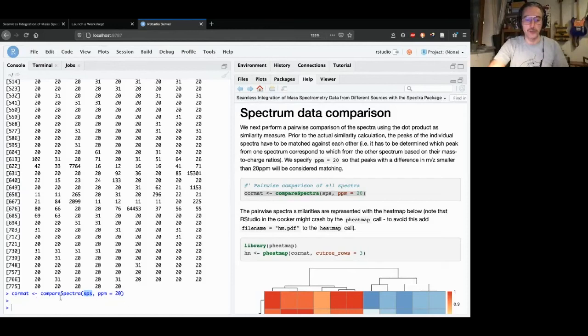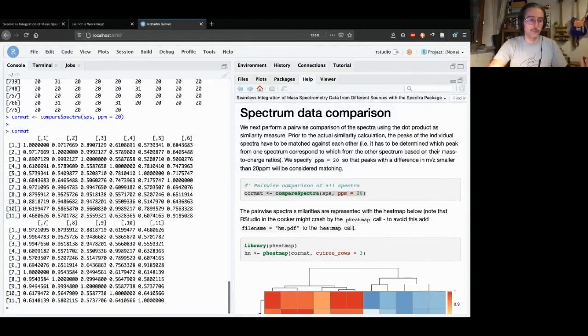So it's creating now a similarity matrix, 11 columns, 11 rows, and we have here the comparison or similarity of the first spectrum with the first. So, well, it's compared against itself, and first against the second, first against the third, and so on. So we calculate similarities.